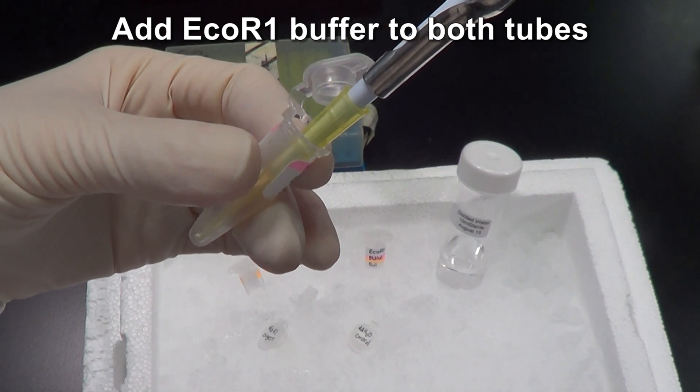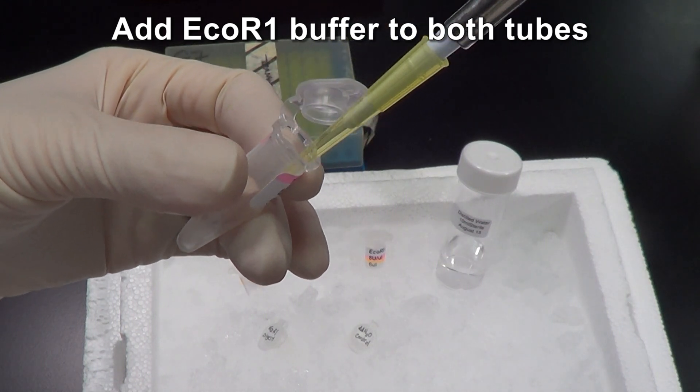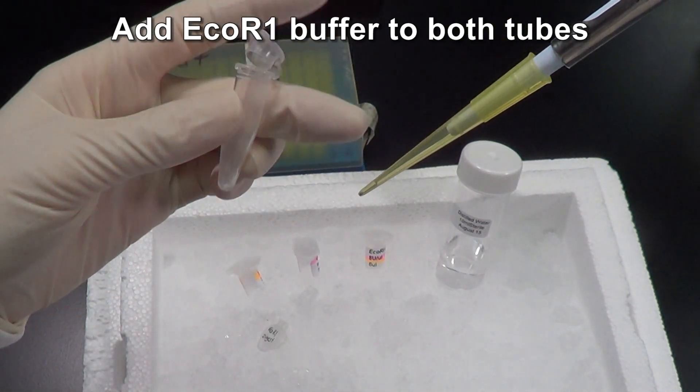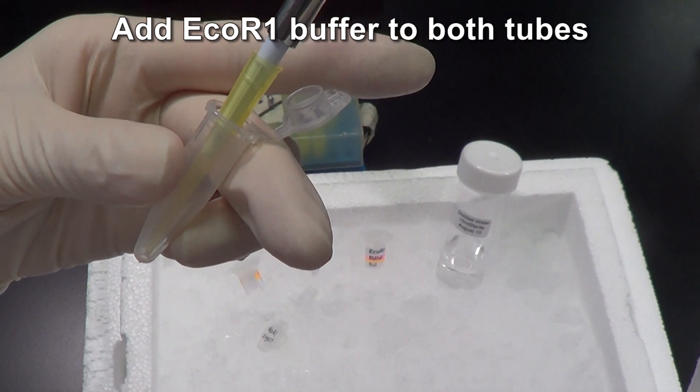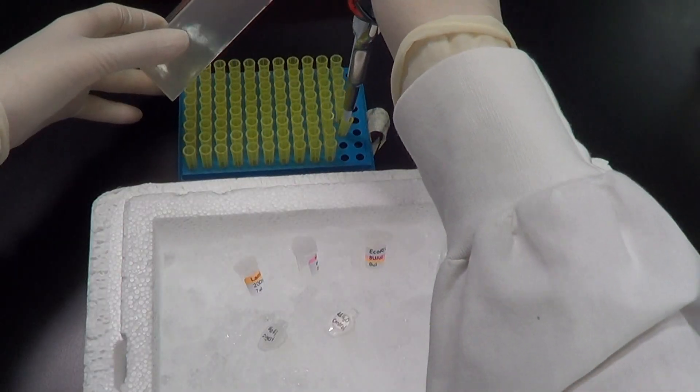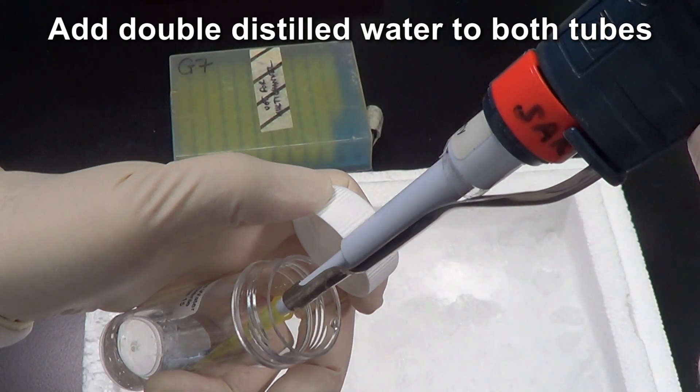When pipetting small volumes, hold the microcentrifuge tube at eye level to ensure you're pipetting the correct volume. Add double distilled water to both tubes.